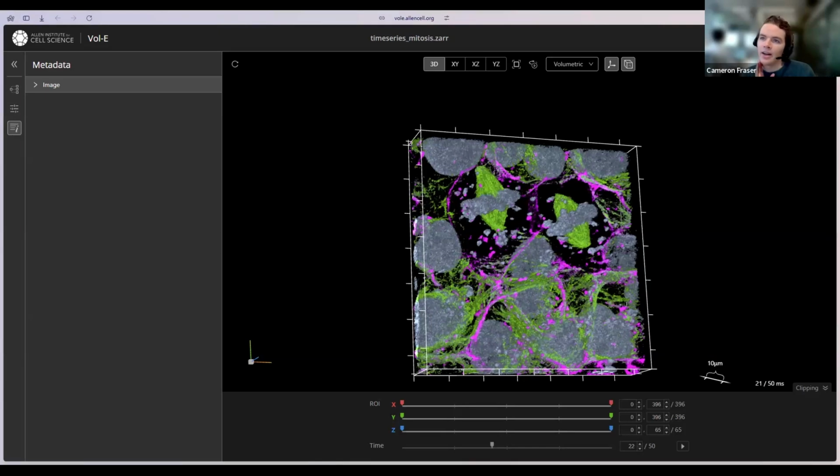I mean, I expect it would depend on the size of each individual image. And in particular, as a data prep question, that's sort of the theme Dan had in his response. So it's probably mostly a data prep question.